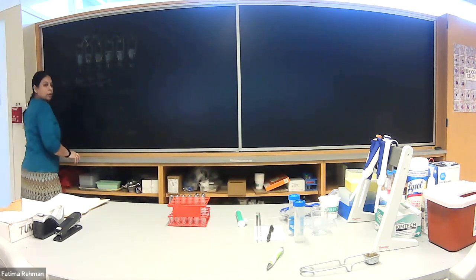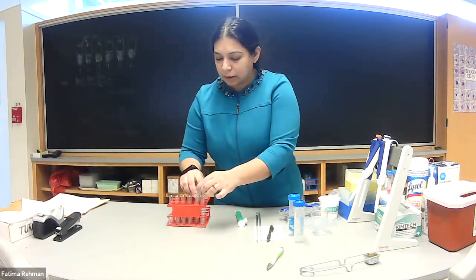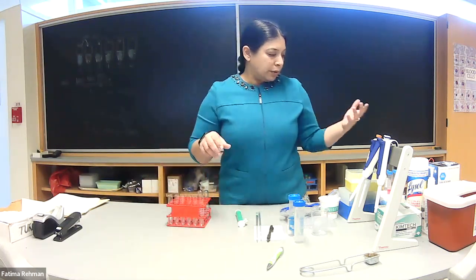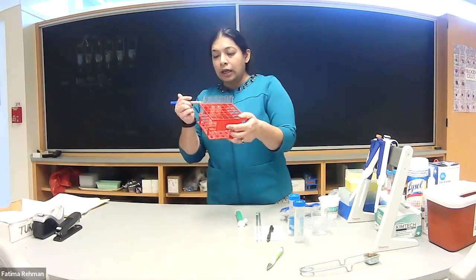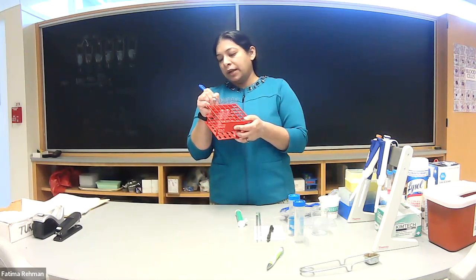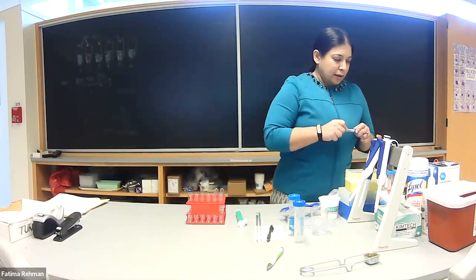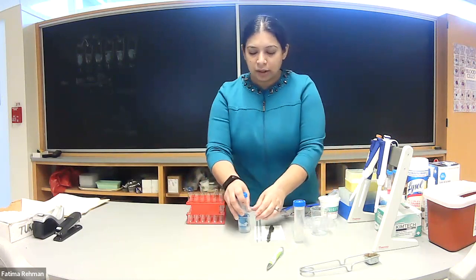Now I'll show you what the serial dilution would look like. We always want to make sure our tubes are labeled so we know which sample is which. If you don't label, I love to flip people's tubes around just to confuse them. Same thing with lids — always label the tube itself, not the lid. Trust me, at some point you'll be confused if you don't.